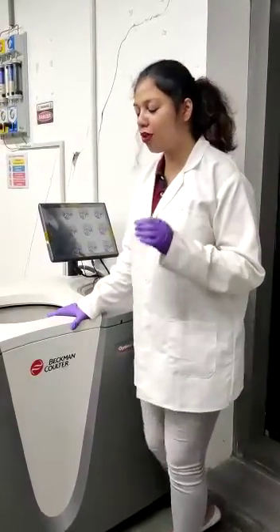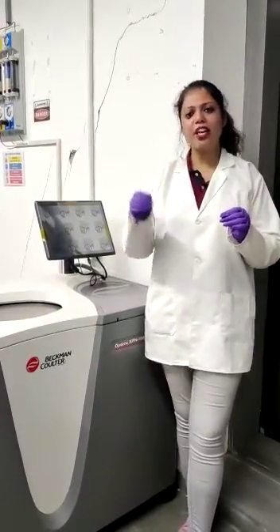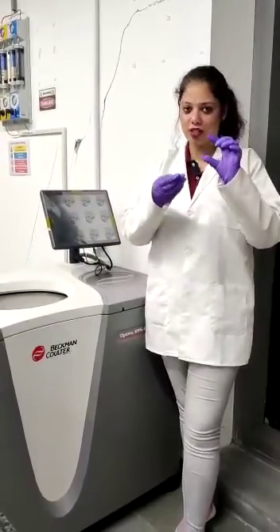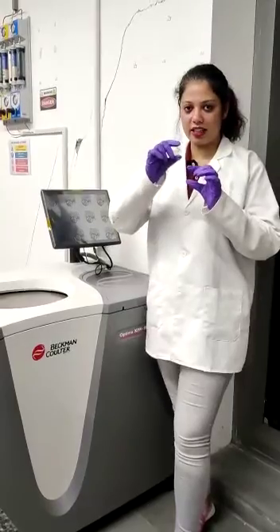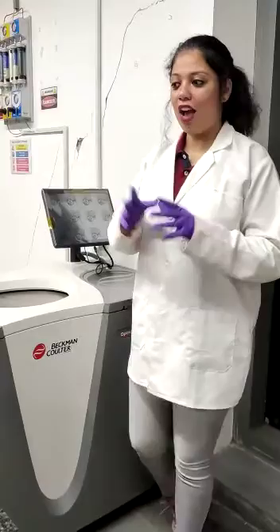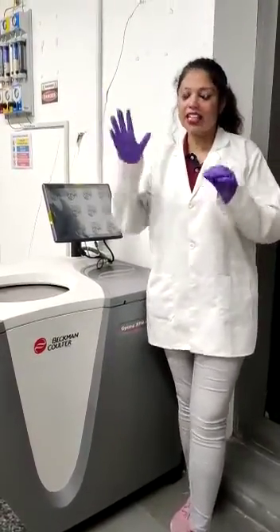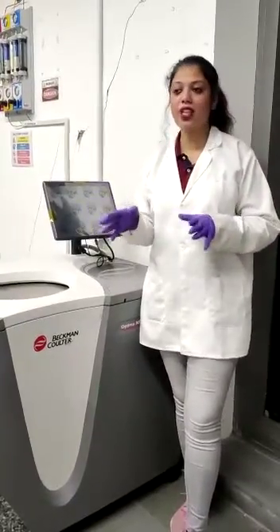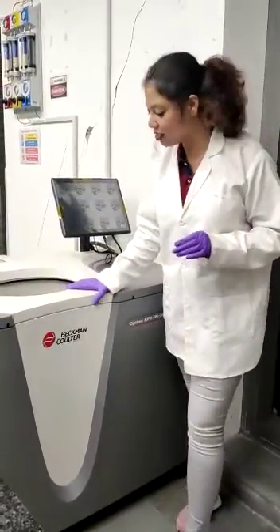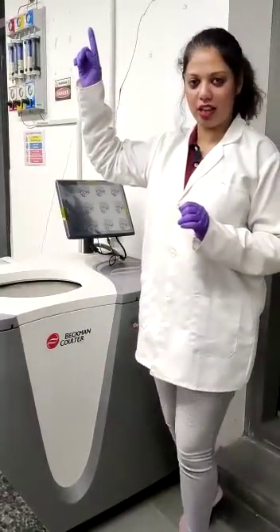Now, how is it different from a normal centrifuge? If you have to separate cells present in the media, you can simply spin it using a normal centrifuge and collect the cells at the bottom as a pellet and the media as a supernatant. But to separate subcellular components present in the cells, you need to run the samples at the highest velocity. A normal centrifuge can go to a maximum of 30,000 rpm, whereas an ultracentrifuge starts at 50,000 rpm and goes up to 150,000 rpm.